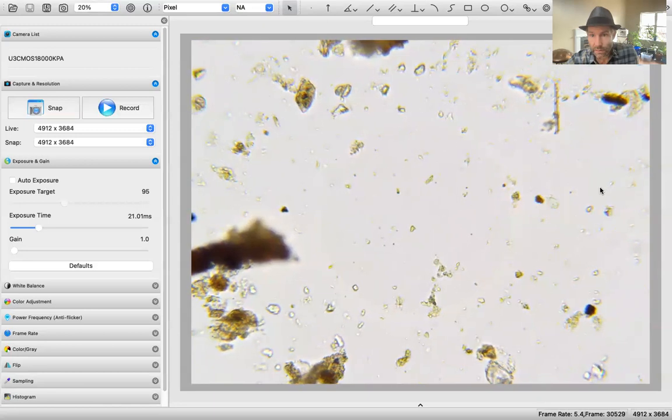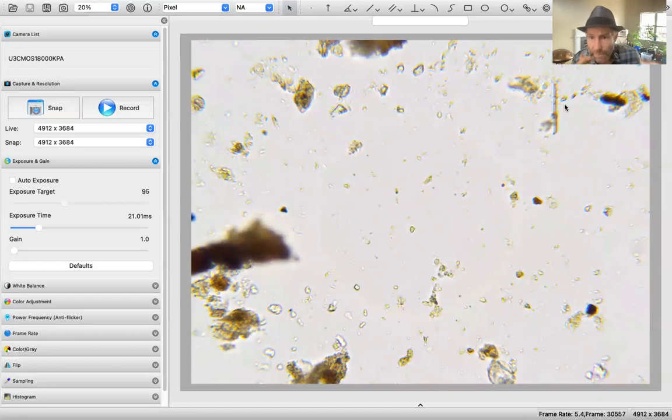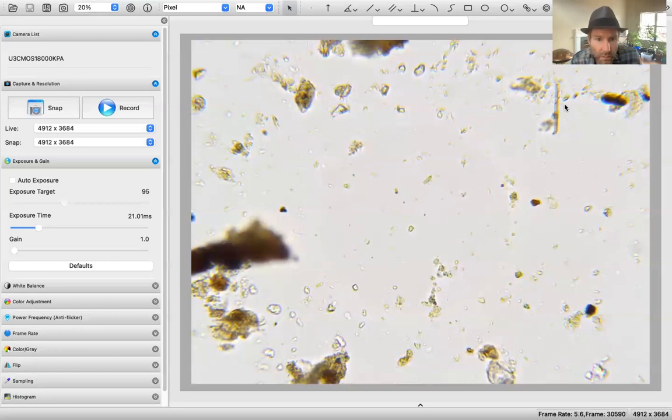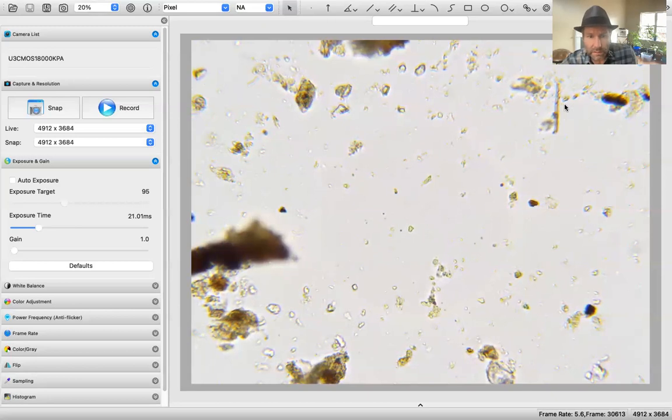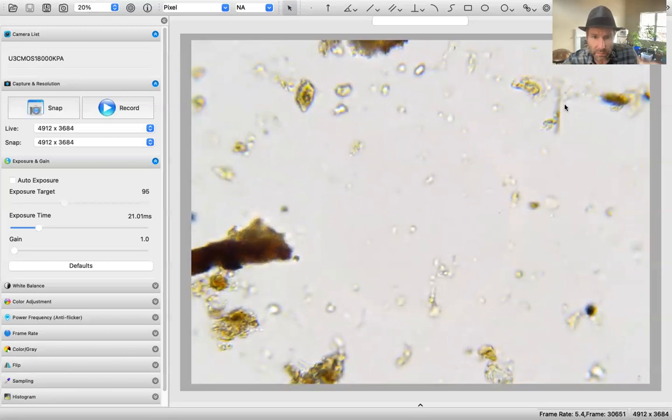Again, that piece of what looks like possible filament here appears to have a tapered end on the top. And I'm not seeing any flagellates or testates. Let me go to the top just to make sure. My dirty cover slide.